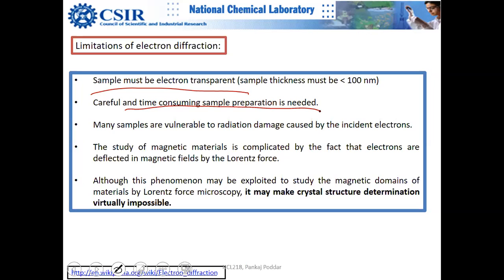Believe me, it is not easy to cut slices of less than 100 nanometers, and there is always a challenge of manipulating the sample. So the life of hardcore physicists, the sample preparation department, is completely different actually. They are very serious people. They seriously do their business. So feel yourself lucky that you are a chemist and you have colloidal samples which can be easily prepared.